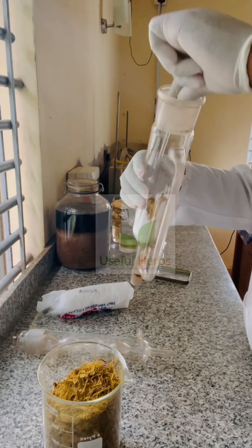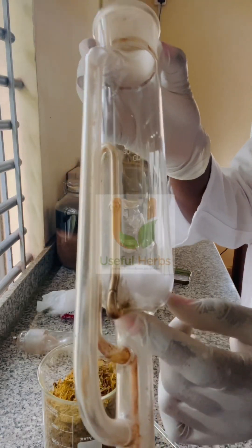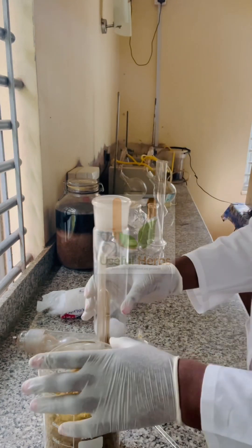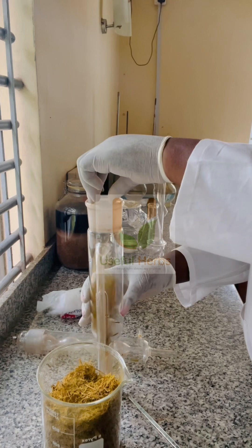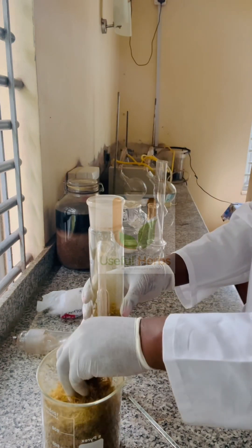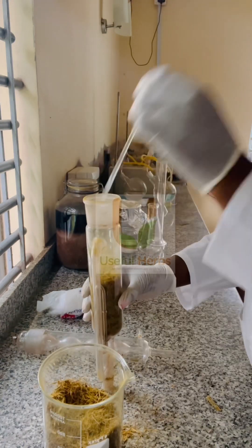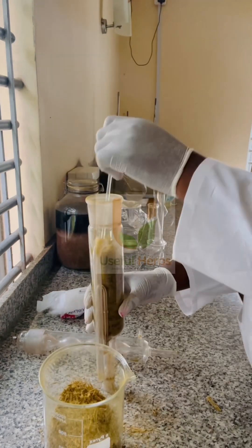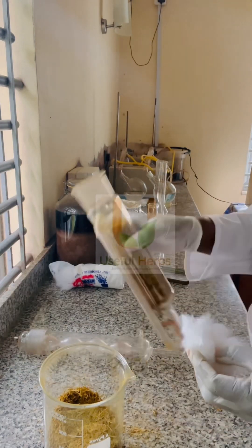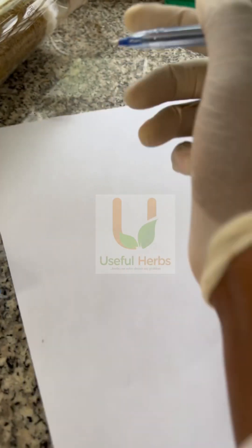I am using my Soxhlet extractor, and I'm going to put some cotton wool to block the siphon tube — which is a thin tube you can see there — so that the plant material will not go into the flask. Then I'm going to pack the plant material into the part of the tube called a thimble. The plant material should not be packed too loosely; you can compress it, but don't over-compress it. There is a little space at the top where you put cotton wool to prevent scattering.